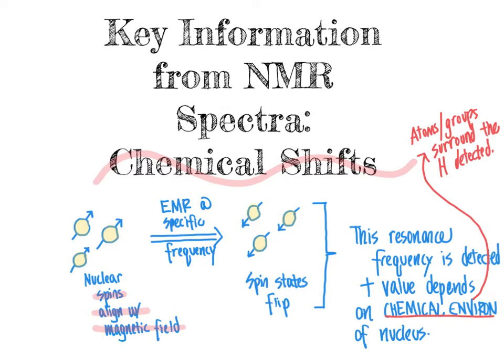And so in other words, if we were looking at a structure like this, say, of an alcohol, ethanol, what we would find is that the chemical environment of the proton that is part of the hydroxy group that I drew the blue arrow to here in your upper right corner, the chemical environment of that proton is different than the chemical environment of the two CH2 protons.